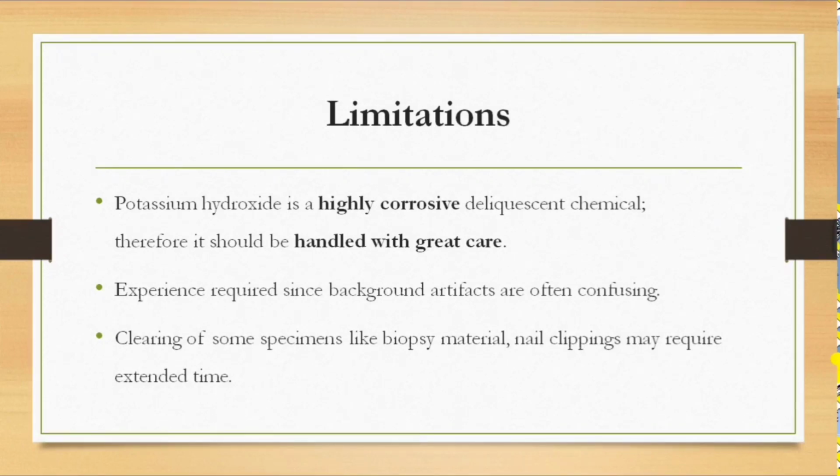So the limitations of using potassium hydroxide: as it is a corrosive and deliquescent material, it has to be handled with great care, and experience is required since background artifacts are often confusing. Clearing of some specimens like biopsy materials and nail clippings may require extended time. These are the limitations of using a KOH wet mount in the laboratories, in spite of its many advantages.